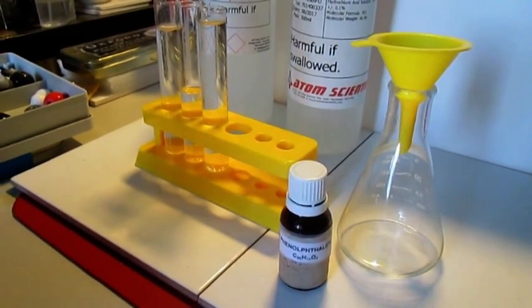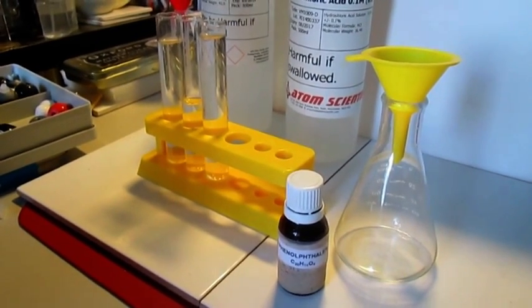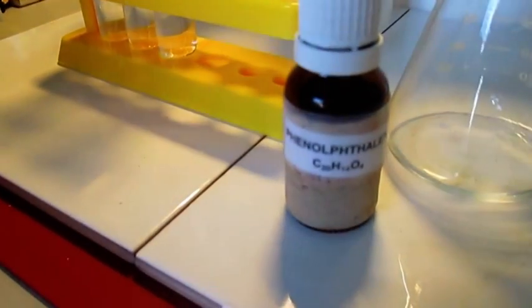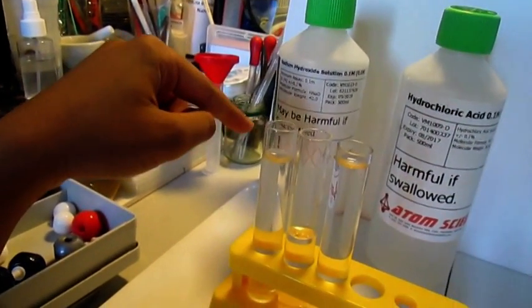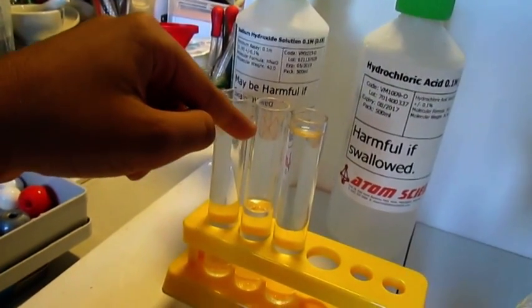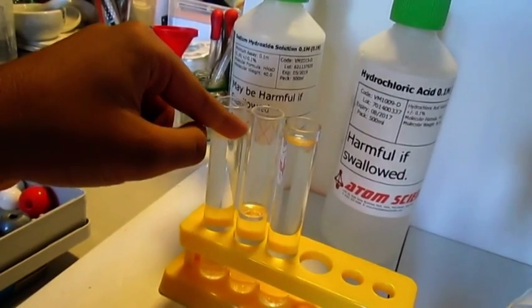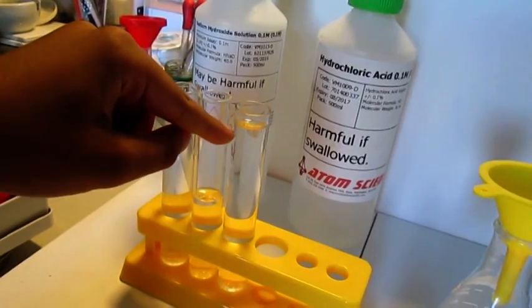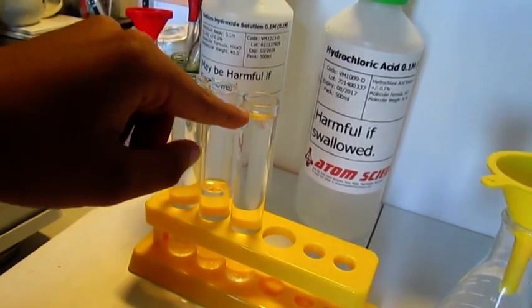In this experiment, I will demonstrate how a chemical compound phenolphthalein is used to determine if a solution is an alkaline or an acid. The first test tube on the left contains phenolphthalein. The second test tube on the left contains sodium hydroxide, which is a strong alkaline. The third test tube contains hydrochloric acid, which is a strong acid.